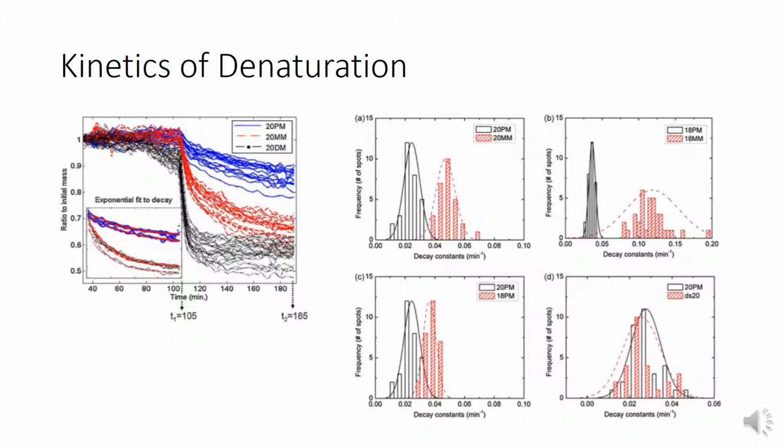And once this graph was generated, the denaturation process was fitted to exponentials in order to determine the difference in the denaturation, and the decay constants for these exponentials are plotted in figure 4 on the right, where one can see that the longer, more well-matched strands are more stable as anticipated.